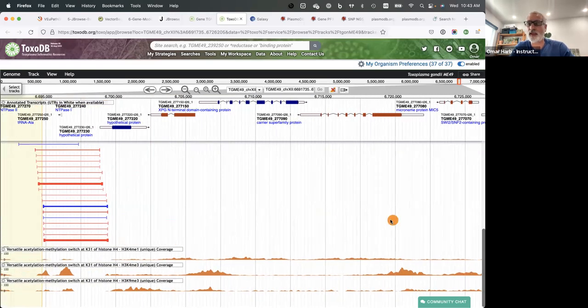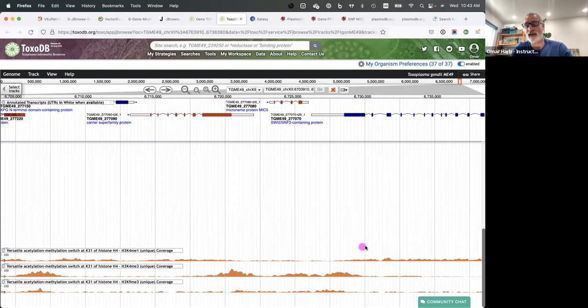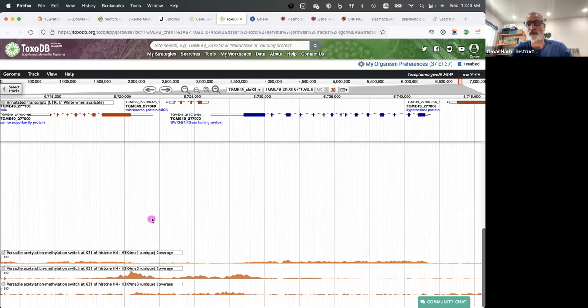And so I think, without even knowing what this particular histone mark here, the middle one does, you can potentially conclude that, oh, maybe this is marking the beginning of the genes, right? And I think this is accurate for this particular histone.